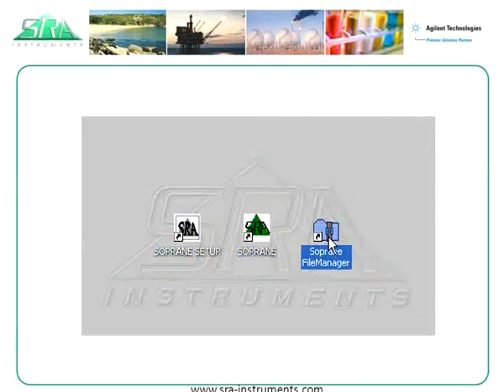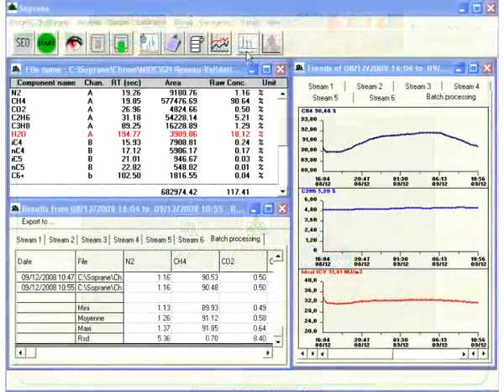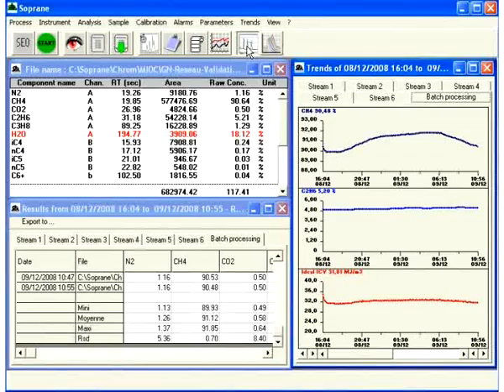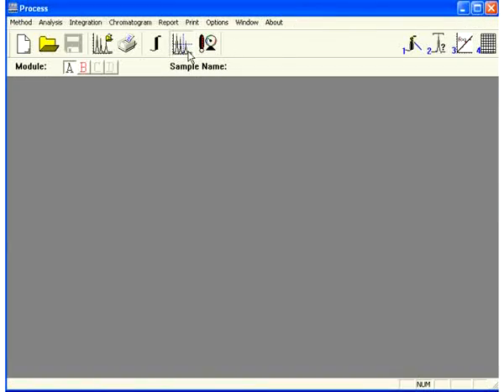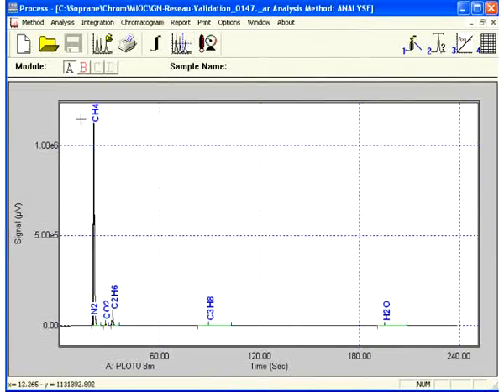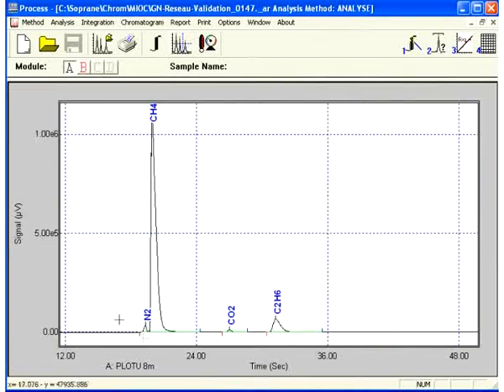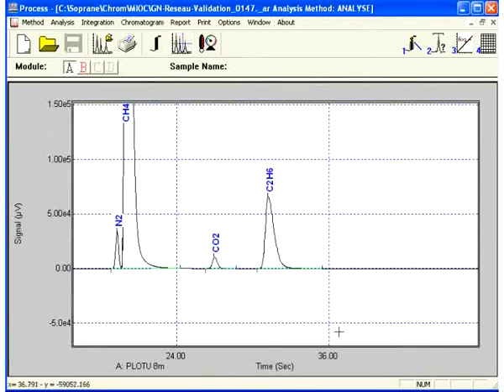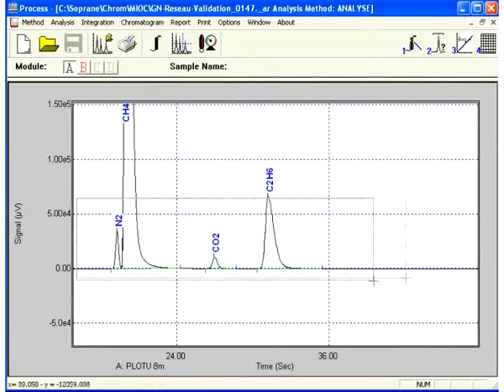The Sopran main module is the part of the software used to automatically control your analysis. You decide what should be done and Sopran does it.